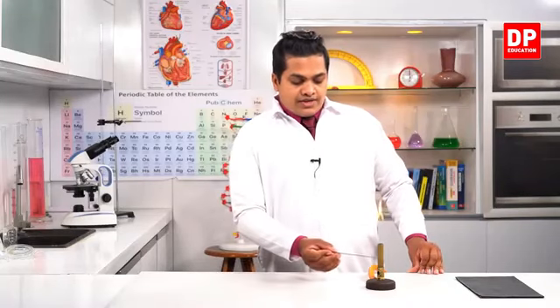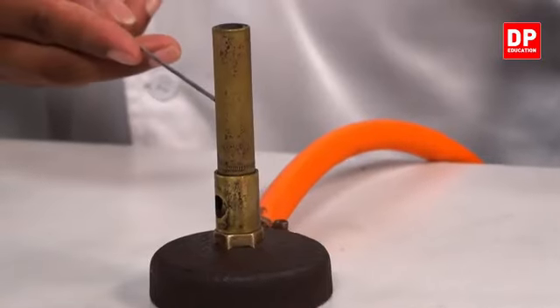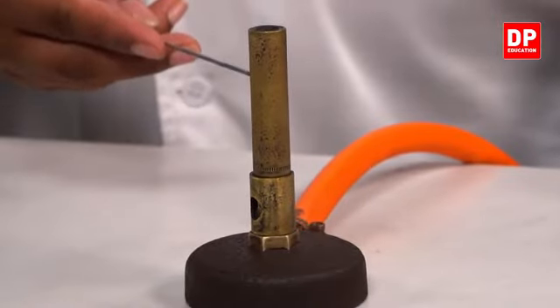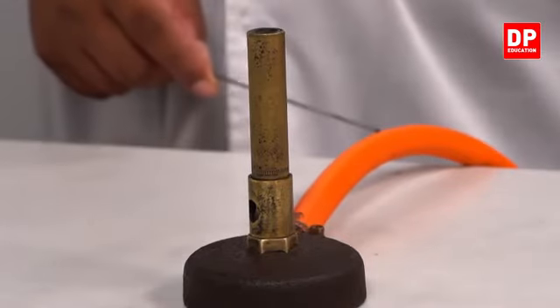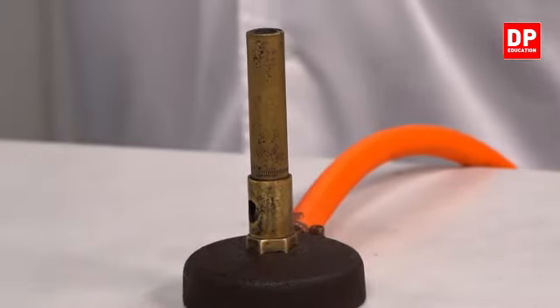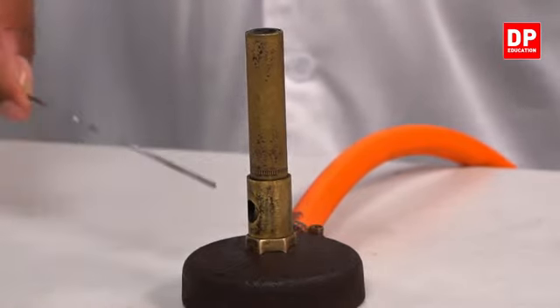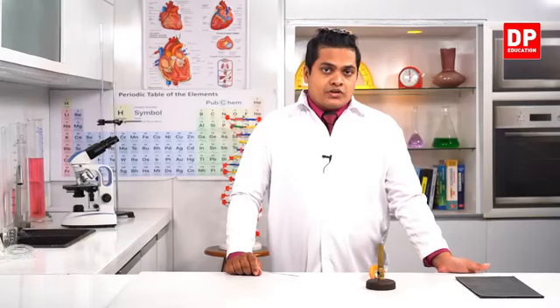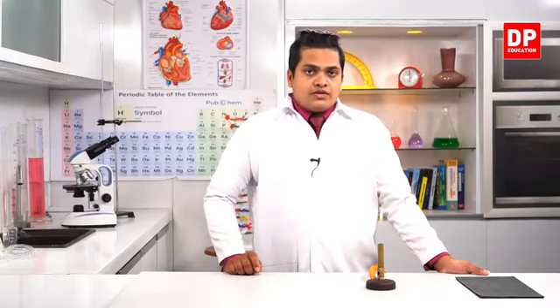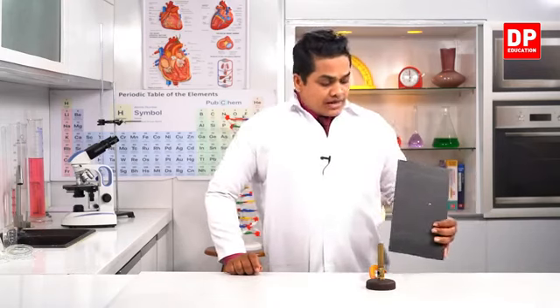And you can observe the stem of the Bunsen burner next. This is the stem, and after the stem, you can observe the end of the Bunsen burner. So this is the gas tube which is connected to the LP gas supply. The LP gas coming out from the tube will get burned within the stem like this. So now let's identify the zones in a Bunsen flame. I'll keep a black board so that you can clearly observe.